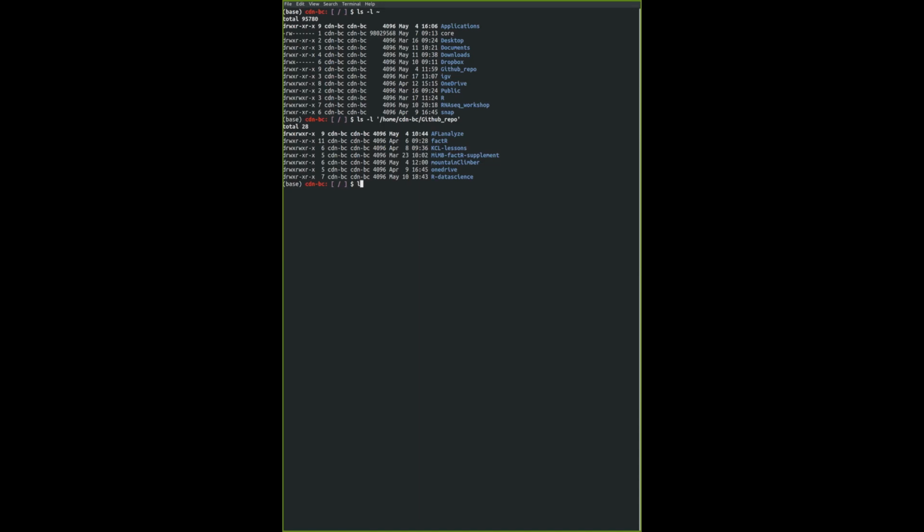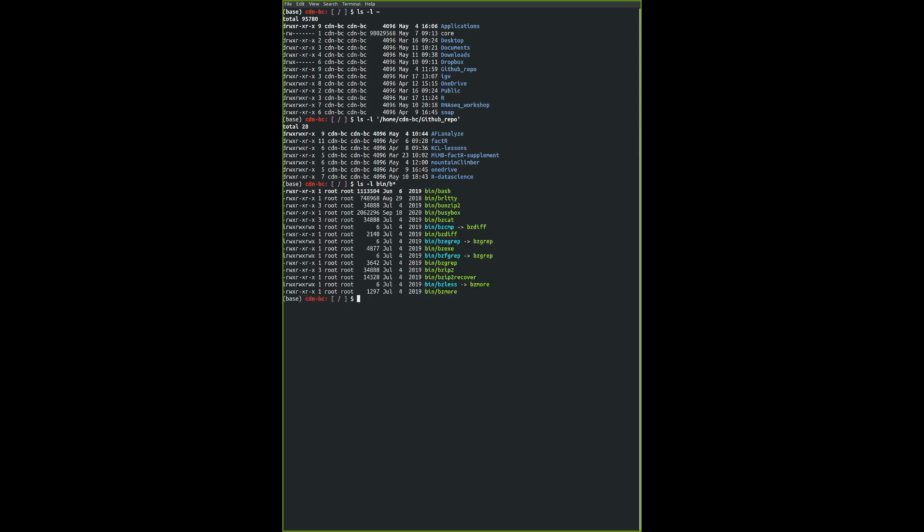So I'm going to show you how we do it on the current root directory that we're in. If you try ls -l, and then we look at the directory bin, I'm going to print out all the files and folders that begin with the letter B. The way we do it is to type bin with a forward slash, and then type B and an asterisk. So it should look like this. I already pasted it on Etherpad, so if you can't follow this, you should do that on Etherpad. And when I press enter, it will list out a smaller list of files or folders that start with B.